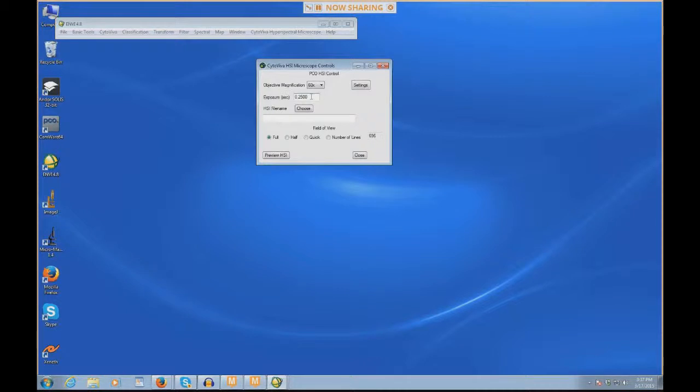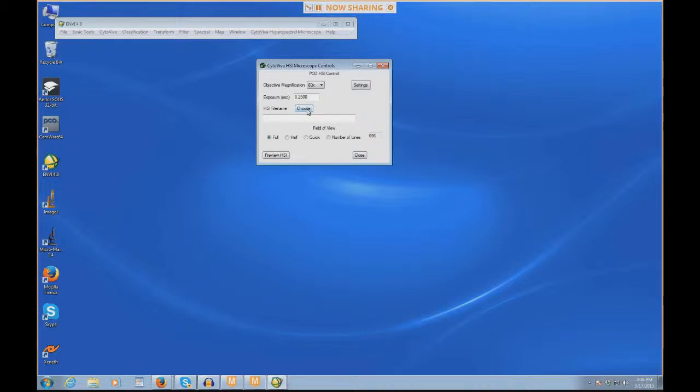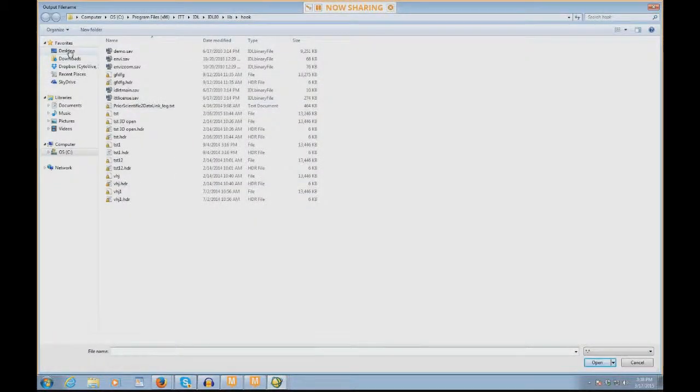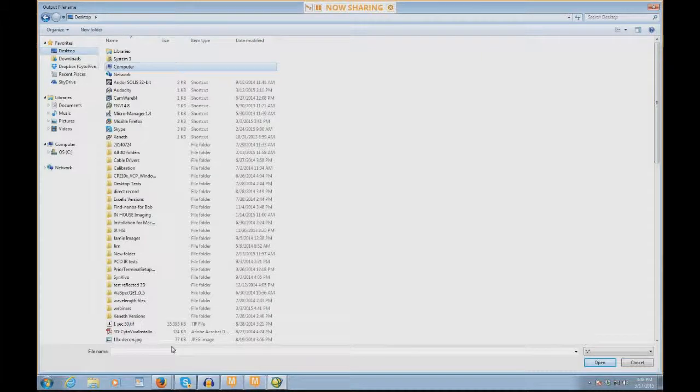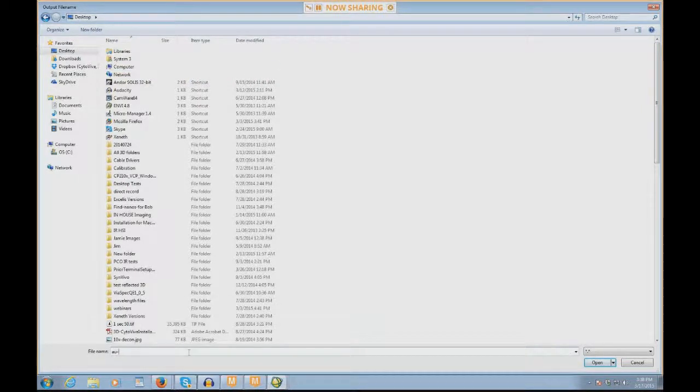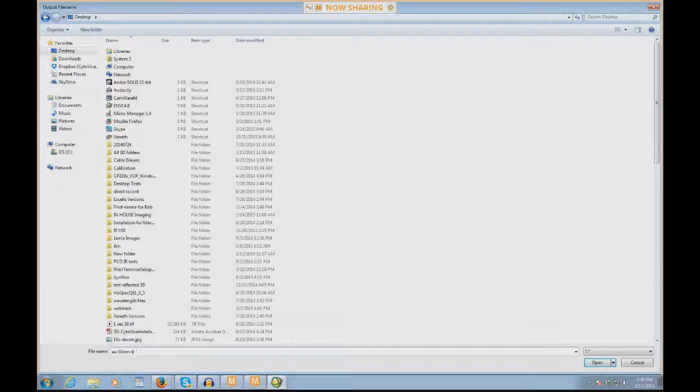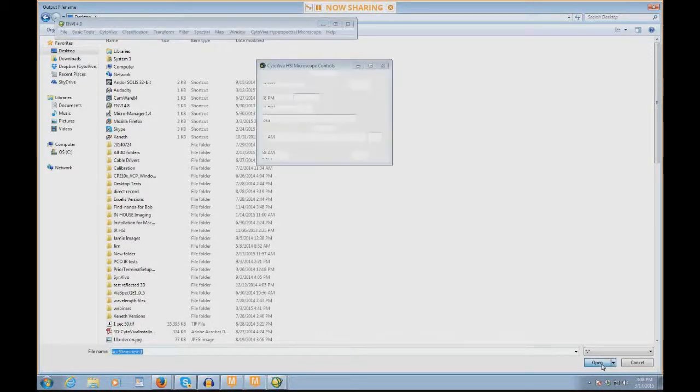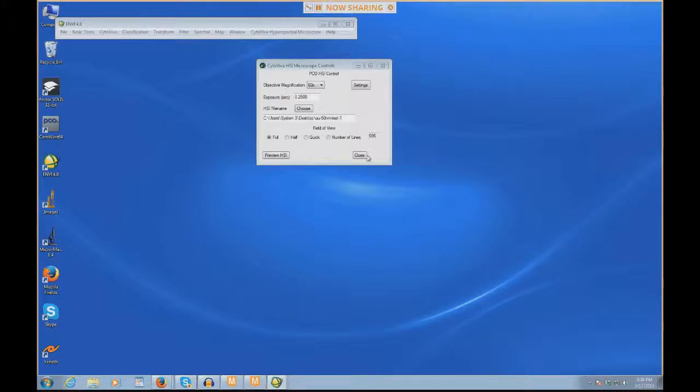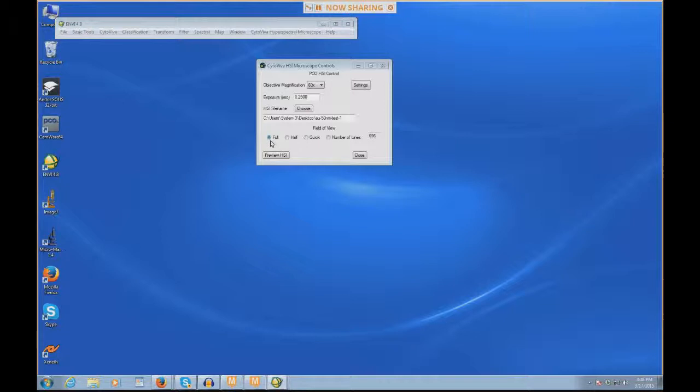I'm going to select my magnification, which here is 60x. The exposure time defaults to 250 milliseconds. This can be changed, and we don't really know exactly what the best exposure time will be yet until we do a preview. I'm going to choose a file name, click choose, navigate to where I want to save this file, and name it AU 50 nanometer test 1. Here in the field of view, we have some choices. You have the option to either do what's called a full scan, a half scan, a quick scan, or a number of lines set by the user.